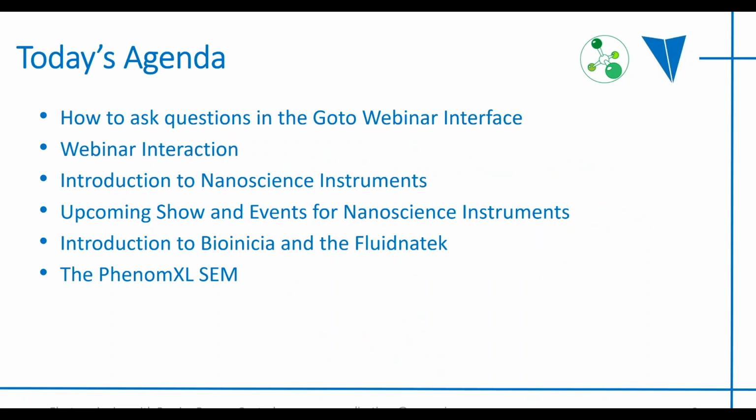I'm going to take you through an introduction of NanoScience Instruments, the upcoming shows and events that we will be attending, and then I will be handing the presentation off to Tom Hayes, our application colleague at Bioinicia, who will take you through a background of Bioinicia and the FluidNatek electrospinning and electrospraying equipment. And then Tom will be handing the presentation off to Matt, who will walk you through the Phenom scanning electron microscope and how you can use this instrumentation in your research.